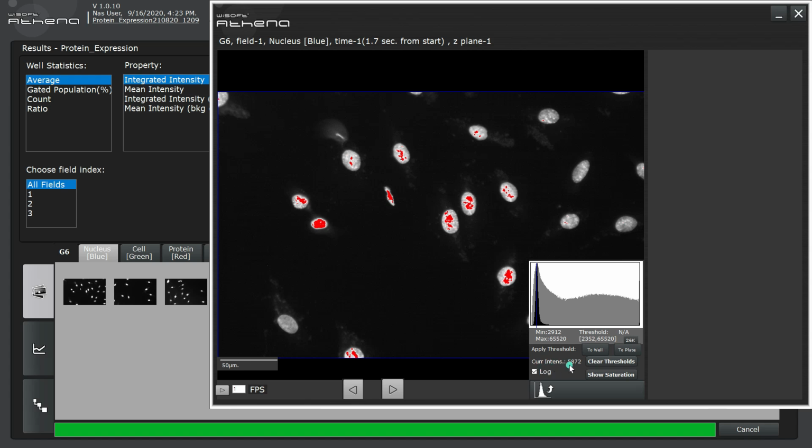If I move the mouse over a dark area, the blue line is on the left-hand side of the histogram and corresponds to low intensity values, whereas when mousing over a bright area, the line moves to the right-hand side, corresponding to high intensity. The initial contrast setting that we see here is defined using the full range of pixel values present in the image.